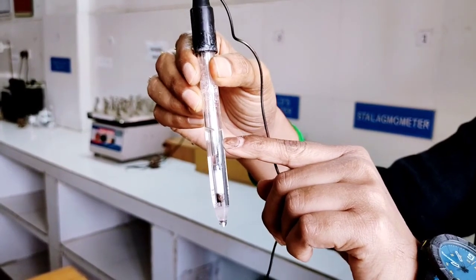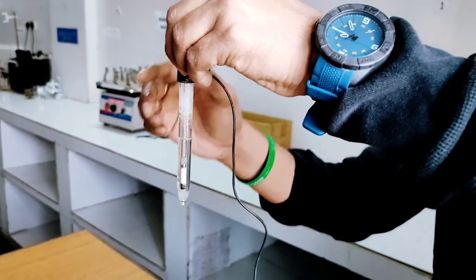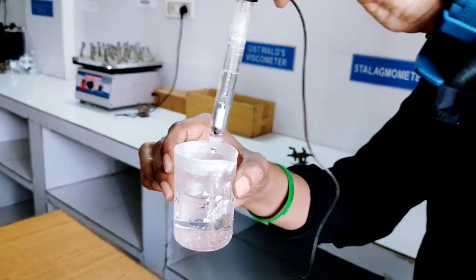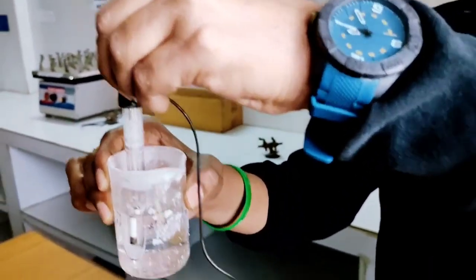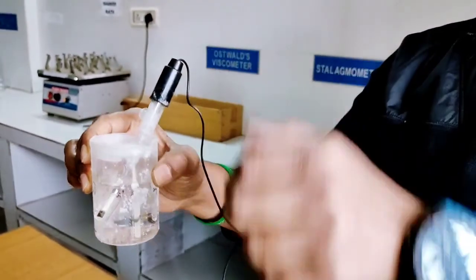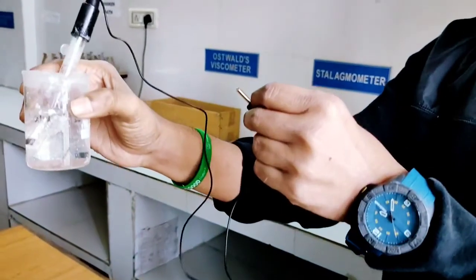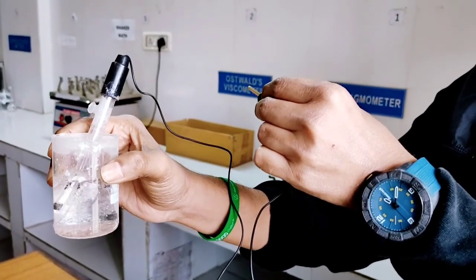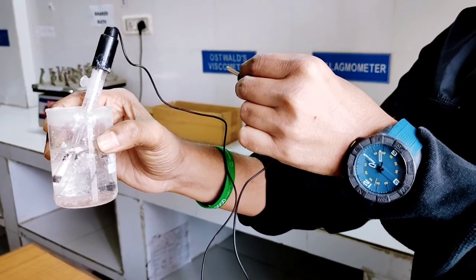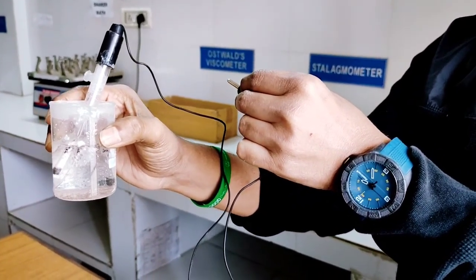So, saturated KCl solution. In order to ensure the saturation of the KCl solution, we have to dip it in the saturated KCl solution which is taken in the beaker, and this should be connected to one end of the potentiometer. So this is how we can construct the saturated calomel electrode. I hope you got this.